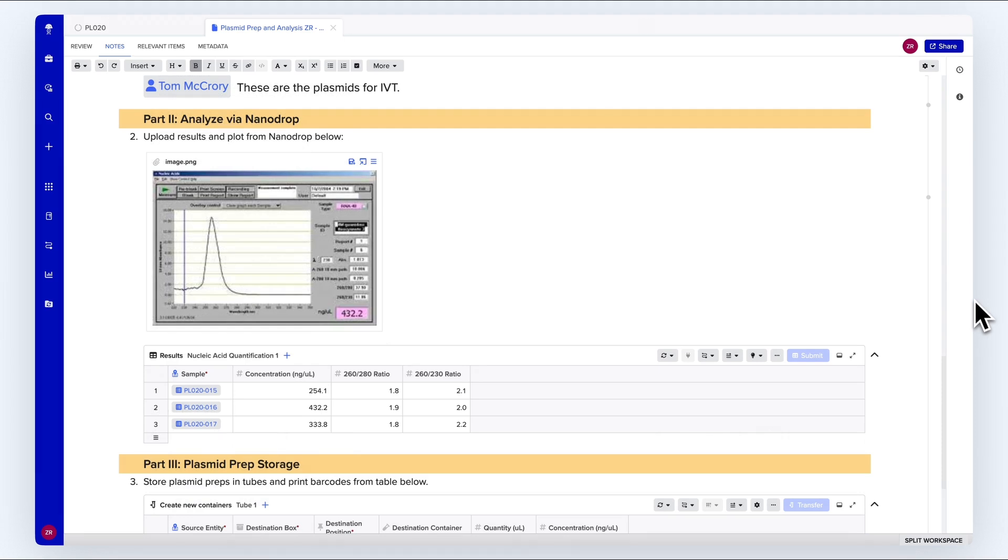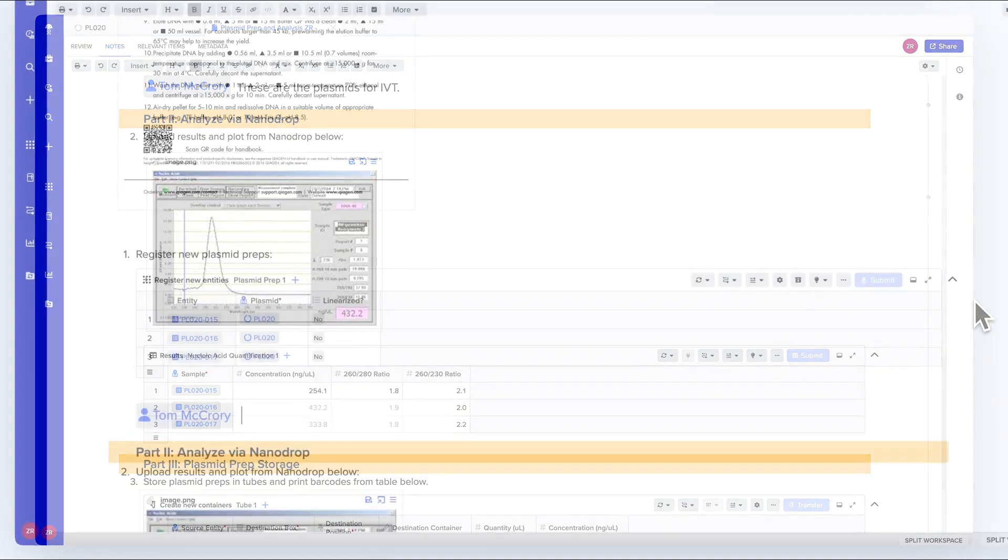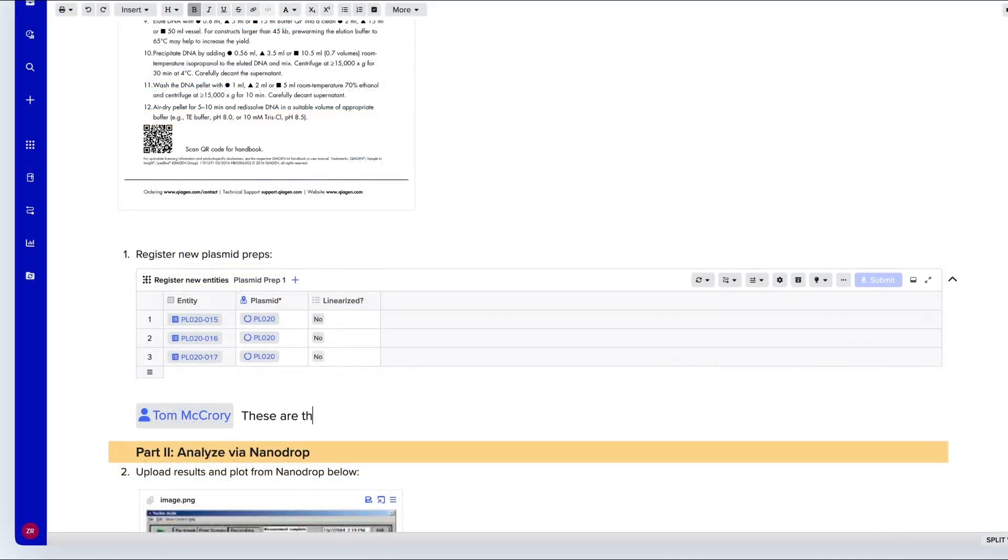I can add protocols, images, links to biological entities like plasmids, containers, and any other information relevant for my experiment. I can mention people in my team to notify them.